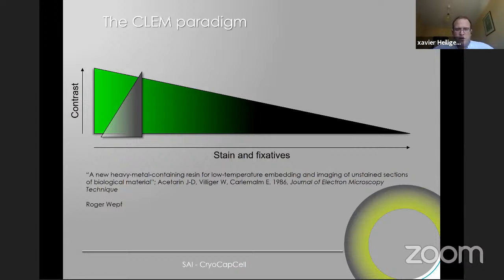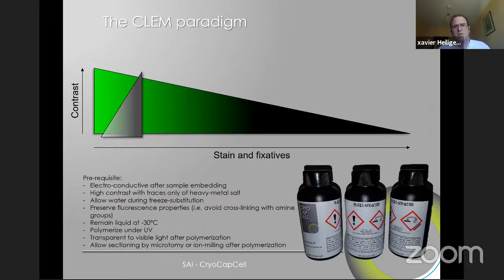So I went to my chemist and we discussed, and the chemist told me, well, you know, it's going to be an explosive resin. So it's quite problematic to have that in the lab, especially for biologists. They're not really used to explosive material. And so what we decided was to start back from a blank page and try to find out how we could make a resin that would fit all our requirements for doing correlative microscopy.